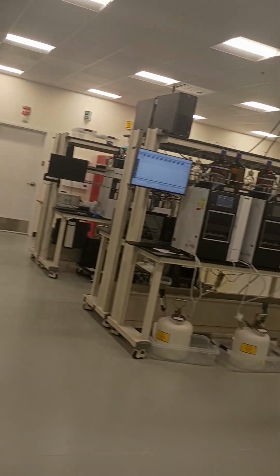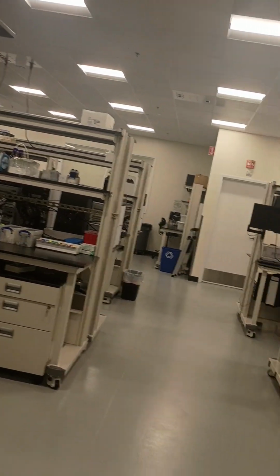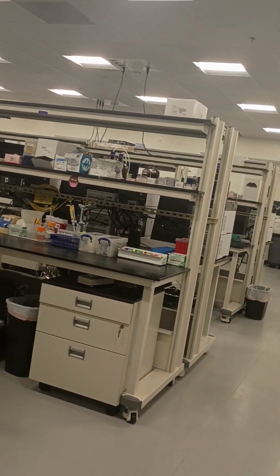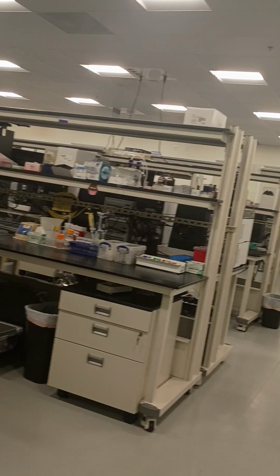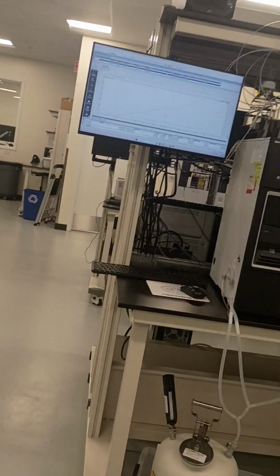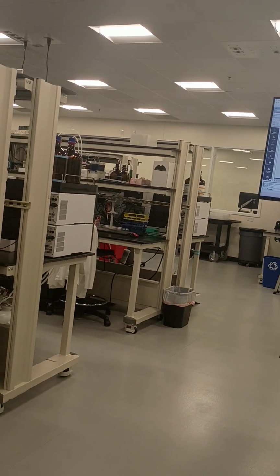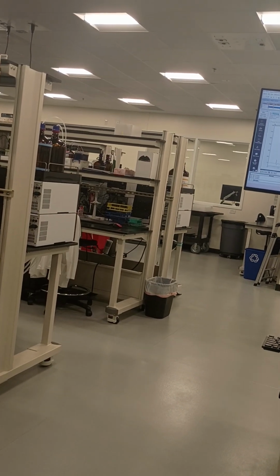When we go home, everything is shut down. Everything is red or orange like that. If it's green, that means somebody forgot to shut it down and the pump is on. You never run anything overnight? That's what we're going to cover. Like this one is running. This is the analytical, and it's also on your SOP. These are not green; they're blue and orange. It's blue when it's running and orange when it's turned off.